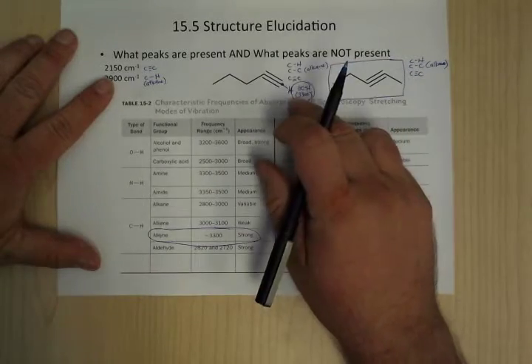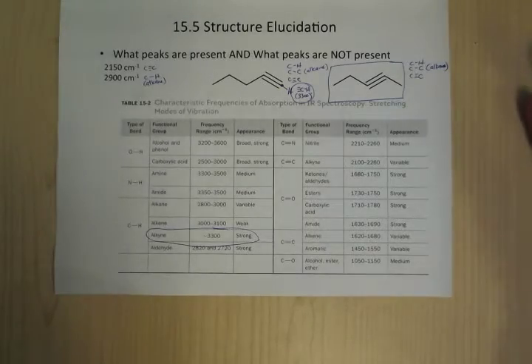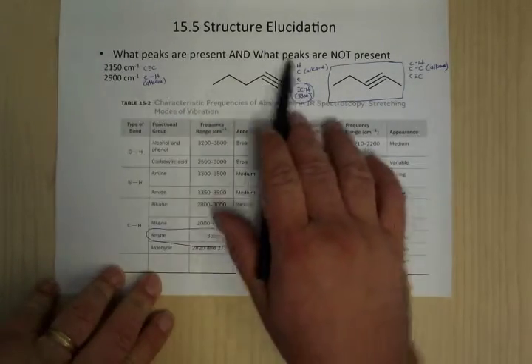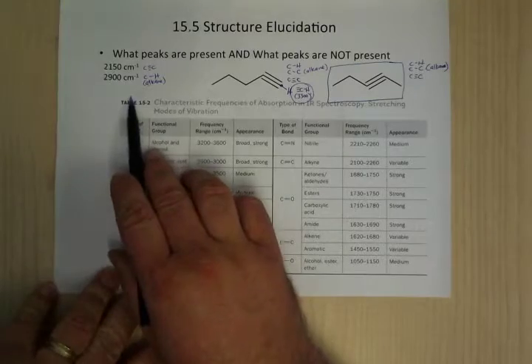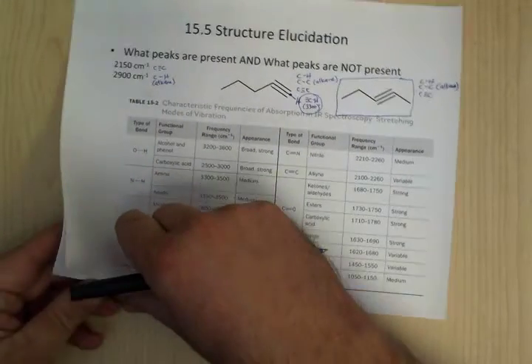We don't have that. Okay, so you have to think about what's there. If it's not listed, there's a reason. Okay, this one corresponds with this. If we had the molecule correspond to this, we'd have to have this peak. We'd have to have a 3300 peak as well. Okay, so you have to think about what's there and what's not there. And it's not always easy.